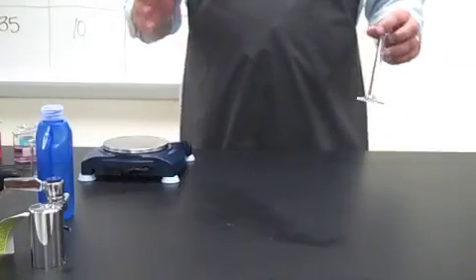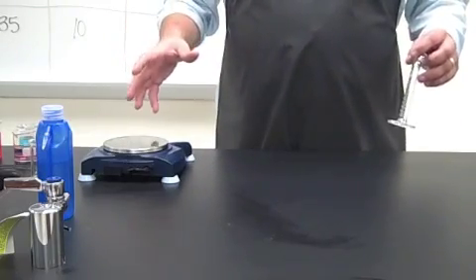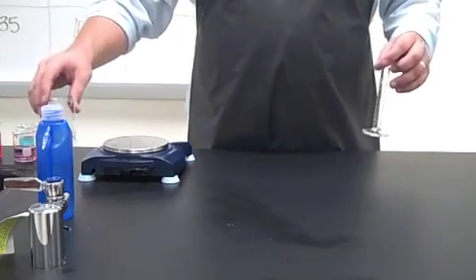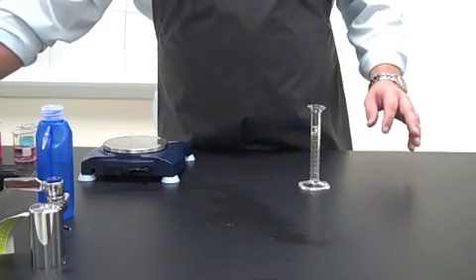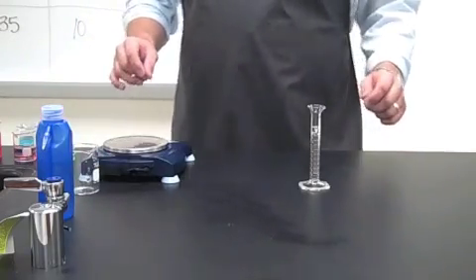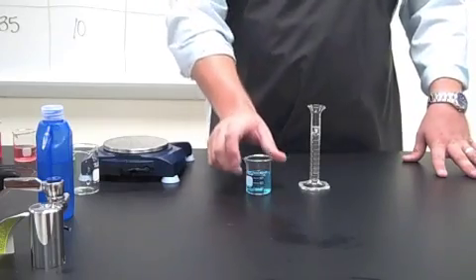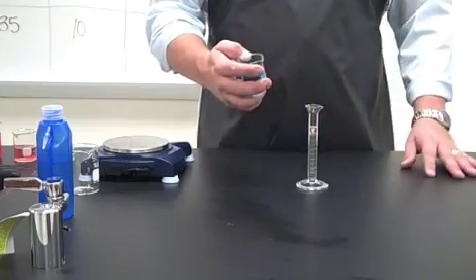Watching this for your pre-lab just to see the procedure, you don't have to write that down, but if you're doing this as a makeup, make sure you're writing this down in your data table that was provided to you in your lab. Now, we're just going to pour that out down the drain, and we're going to start back with our reference samples. We're going to start with the least amount of sugar, which is 5% sugar, and we're going to go ahead and measure out another 10 milliliters.